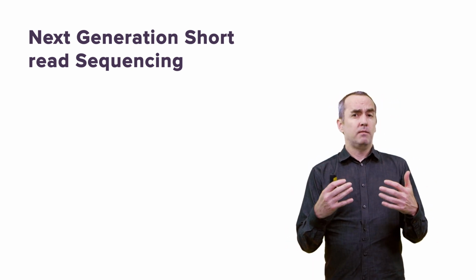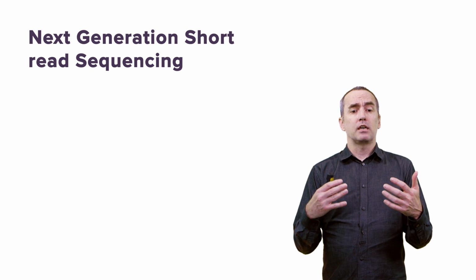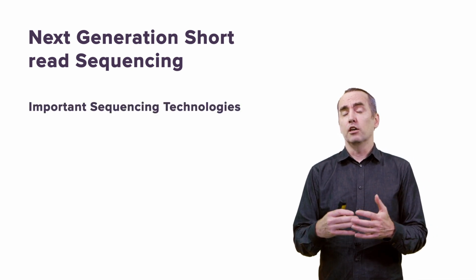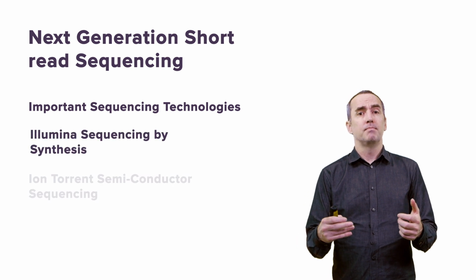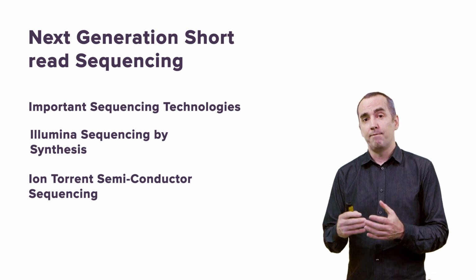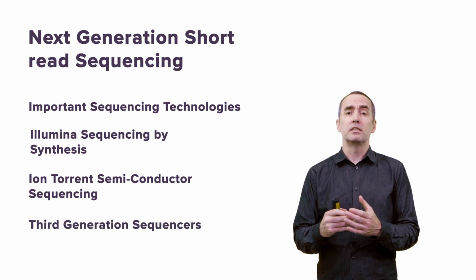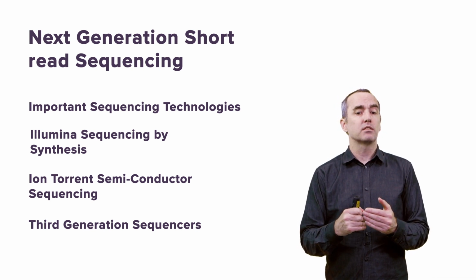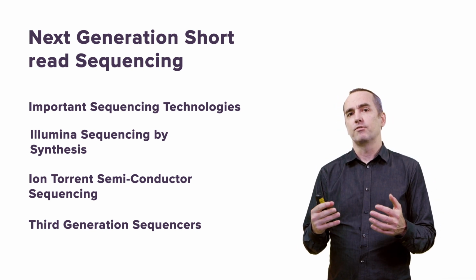So during the next few minutes, we'll be discussing many of the most important sequencing technologies, including Illumina sequencing by synthesis, Ion Torrent semiconductor sequencing, and for third-generation sequencers, we'll be discussing PacBio single molecule real-time sequencing, and Oxford Nanopore sequencing.